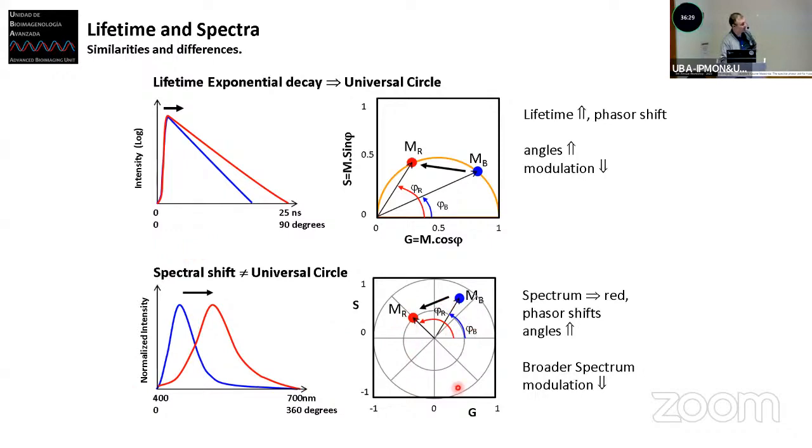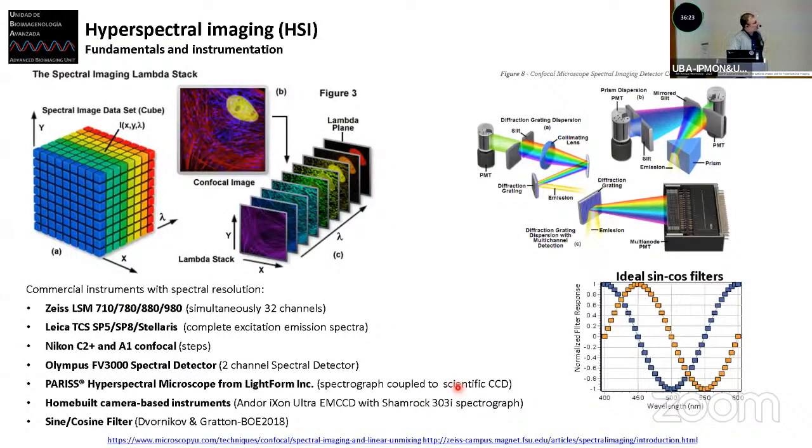So basically, to acquire hyperspectral imaging, which is X and Y with a lambda stack, so we have the same image at different wavelengths, we rely basically on some optics, which can be gratings, can be prisms, or can be some more advanced tools that combine some of these, like the Quasar in the microscope that we will use in the practical session. But then you can collect the spectra using a single photomultiplier, collecting with a slit or with other optical parts small regions of the spectra. So you need to obtain sub-images of different wavelengths step by step.